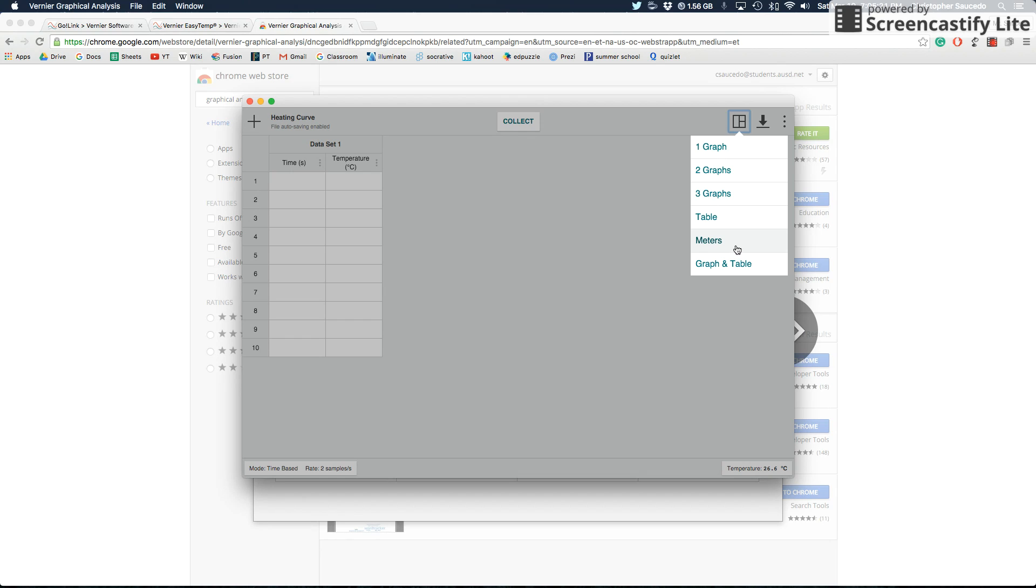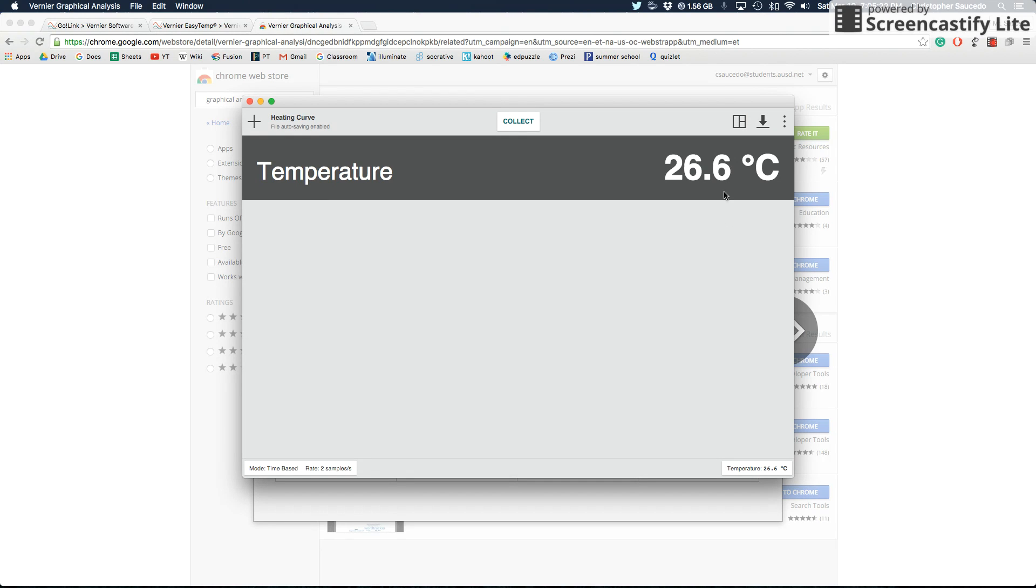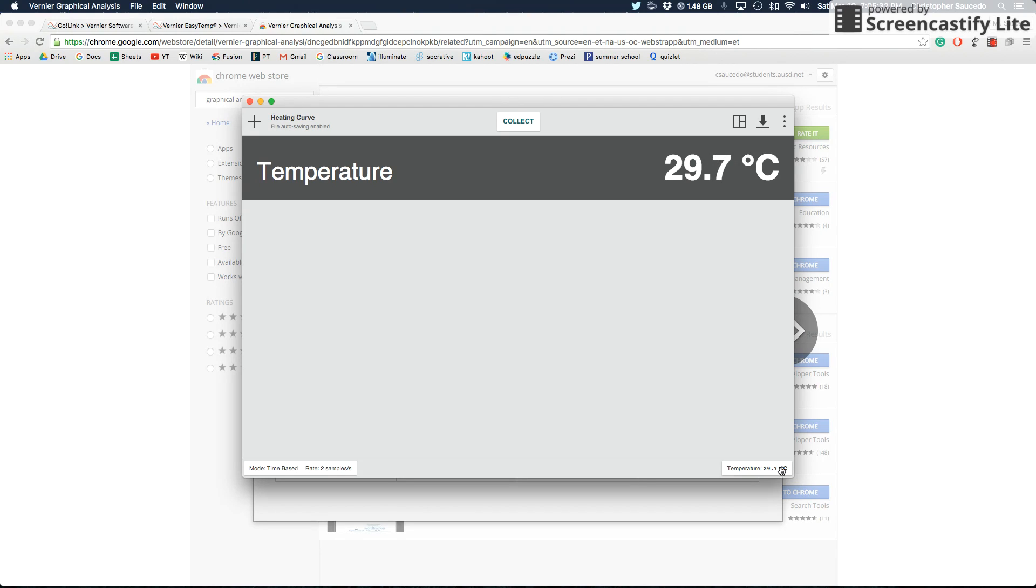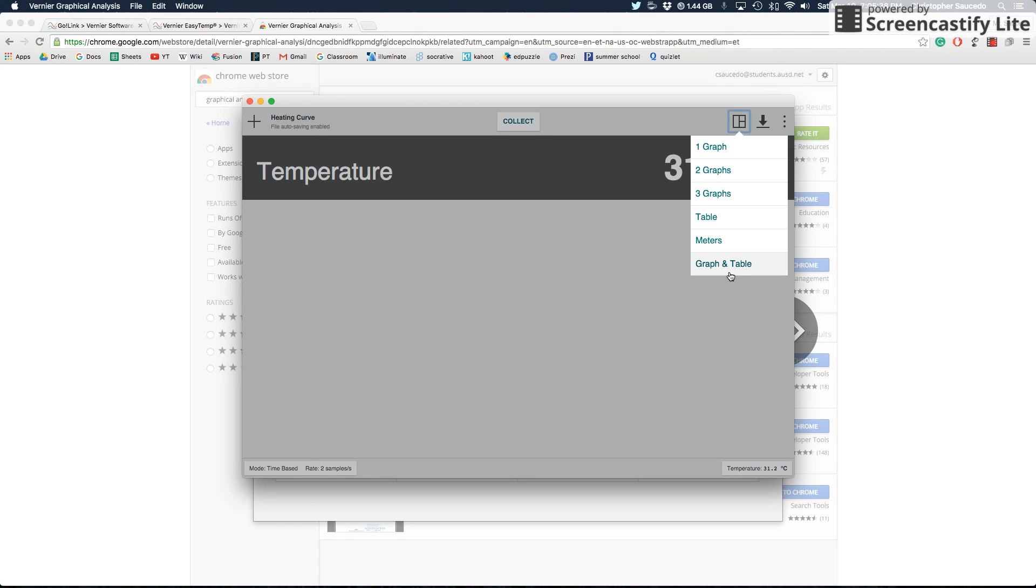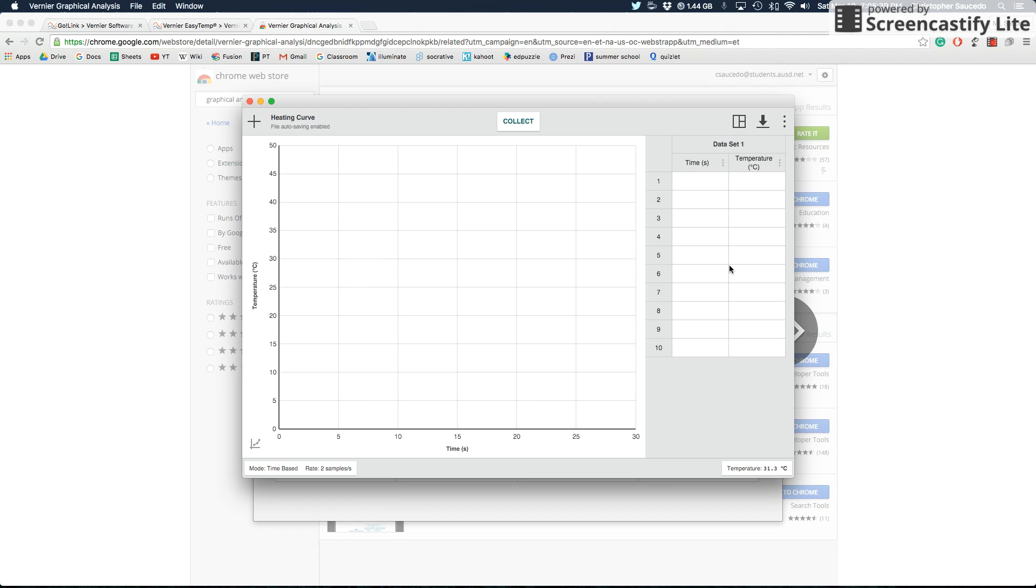If you go to meters, it's giving you in real time the temperature. Right now I'm holding on to the temperature probe, so it's going up dramatically. It also gives you that same piece of information down here at the bottom. I'm going to let go now. And then if you do graph and table, it gives you the graph and also the table data. You might want to use that if you want to actually use the data and see the graph at the same time.